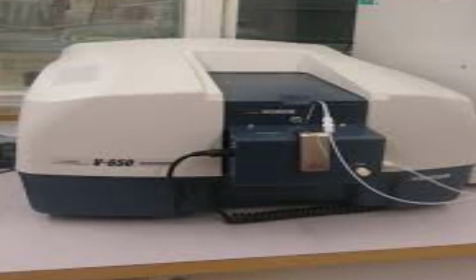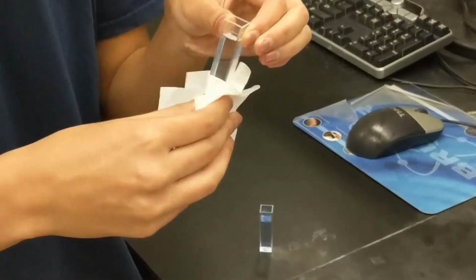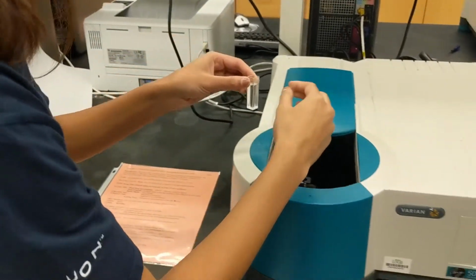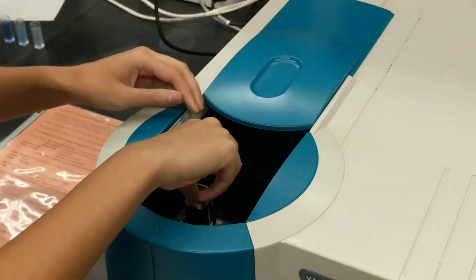Move into the spectrophotometer room and find a machine. The wavelength should be set to 560 nanometers. If it is not, have your TA change it for you. Then, take your zero cuvette and be sure to clean the 2 sides that will be scanned. Open the lid of the spectrophotometer and carefully insert your zero. Close the lid and hit 0 on the program. Then, carefully remove the 0.